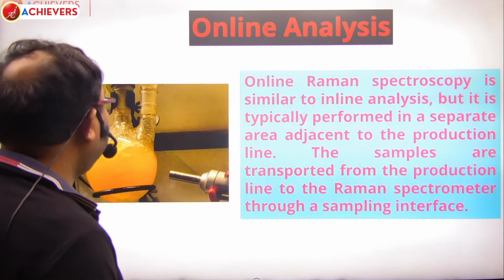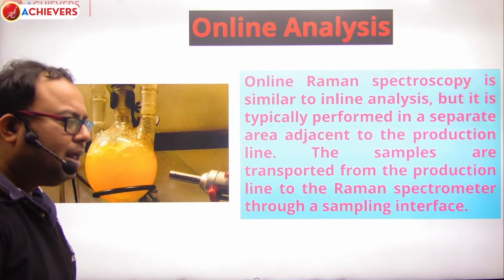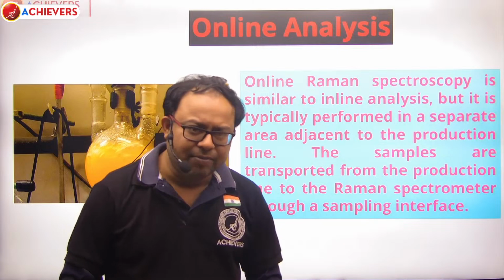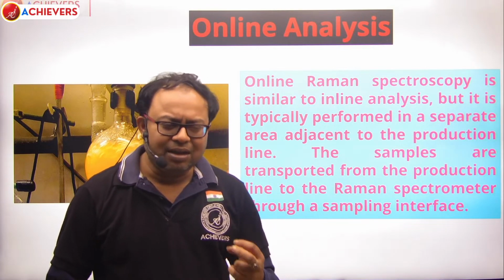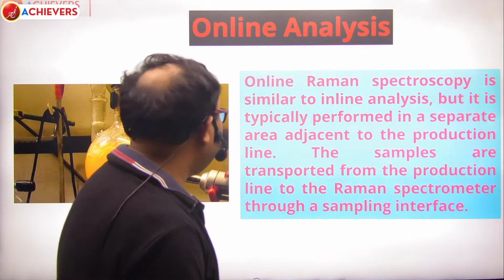Next, we are moving on to online analysis. So you can have a look at the instrumentation. And my dear friends, online and inline analysis are almost similar. Only there is a very small, subtle difference. What is that?